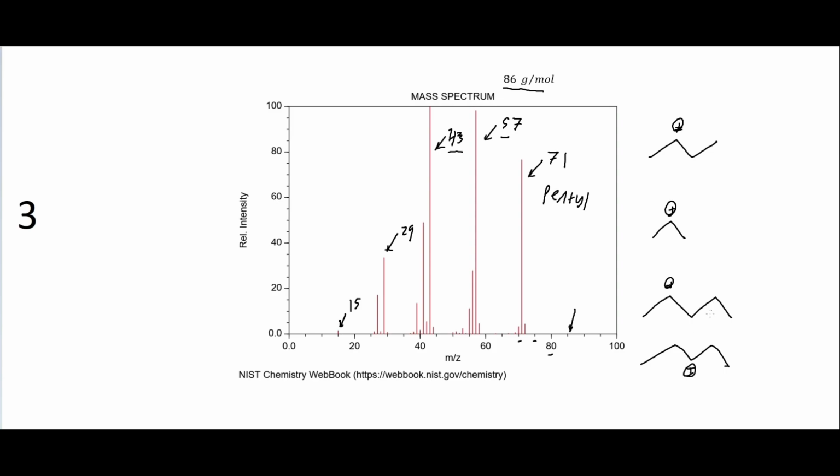Well, we could also, because there are now possible isomers that we can have here, we might have a pentyl group that looks more like this, say. And so that would tell us that maybe it would be on this tertiary carbon. See, this has 1, 2, 3, 4, 5 carbons on it. So it could be a fragment that looks like that instead. And so if we had this right here, and so this looks like it's our largest fragment on here, and so we have our molecular weight of 86, that looks like it's probably the loss of a methyl group.